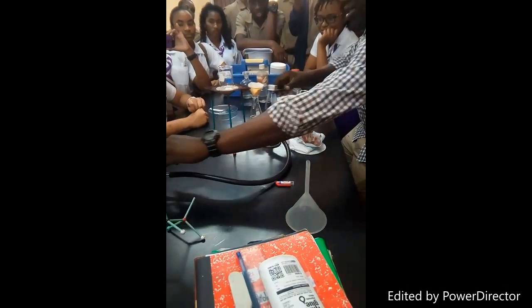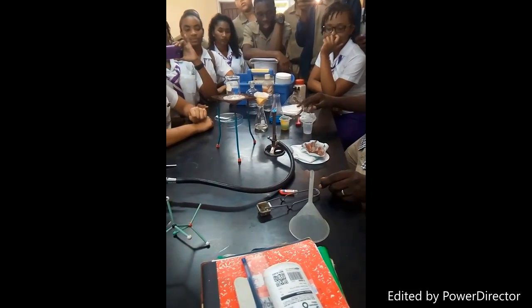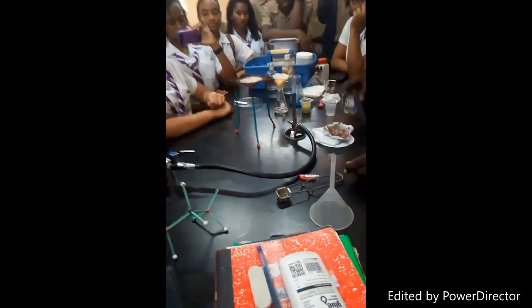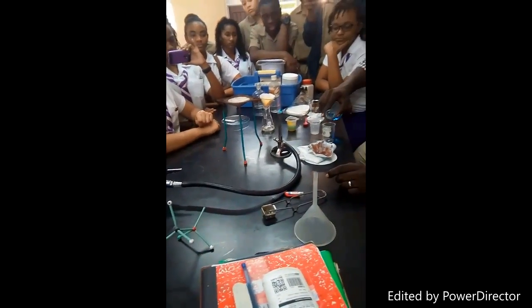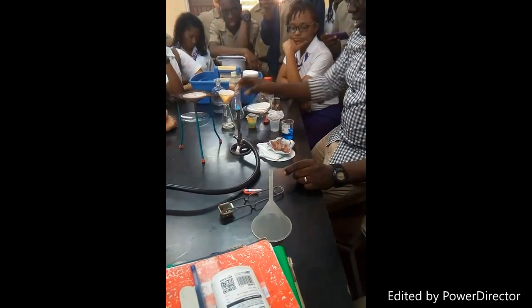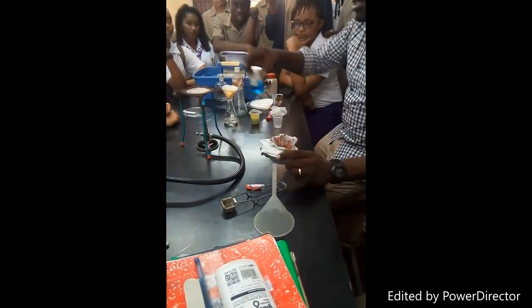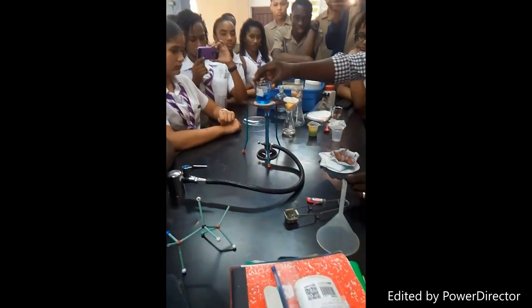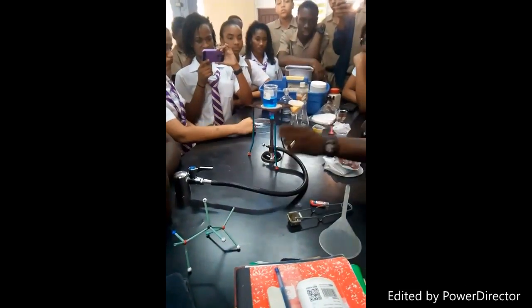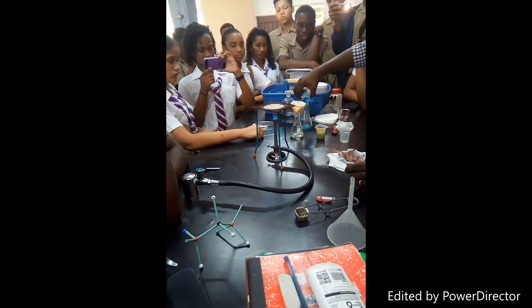Fire is dangerous. Exactly. And we're going to boil this thing. Now, because it contains water of crystallization, did we define that? Yes, we did, sir. Because it contains water of crystallization, we cannot boil it down to dryness. That's too much. Let's make it a little like this.